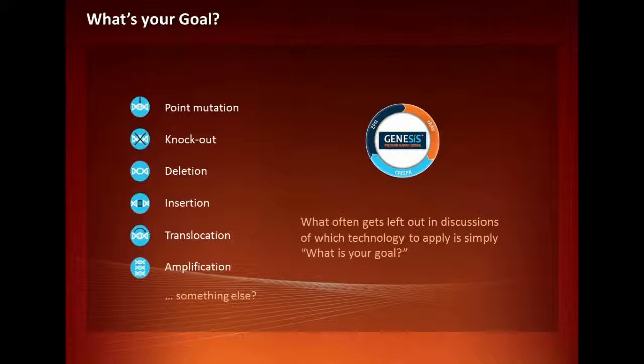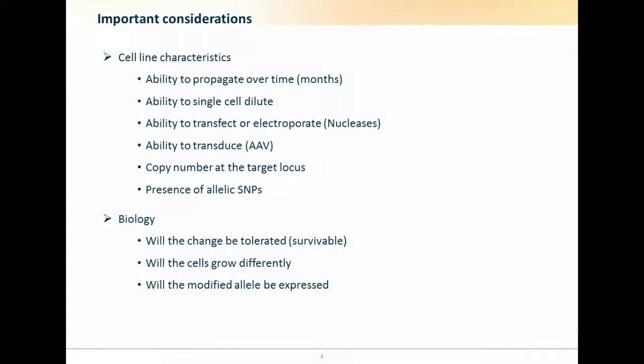Although genome editing is really getting easier and easier, it still requires significant investment in time and expertise. So one thing we've learned is to truly consult our customers on just what they're hoping to achieve and make sure that genome engineering can deliver that for them. There are some very important considerations to keep in mind when you're planning a gene editing experiment.